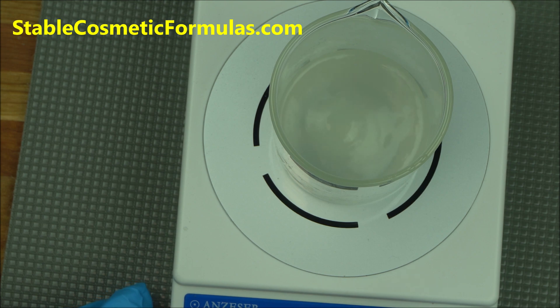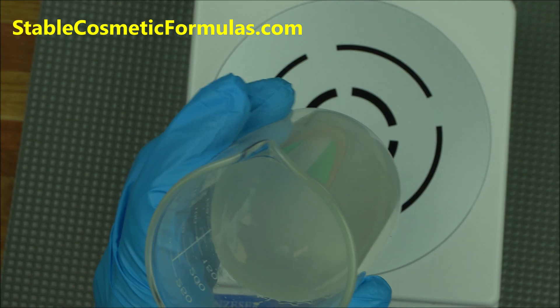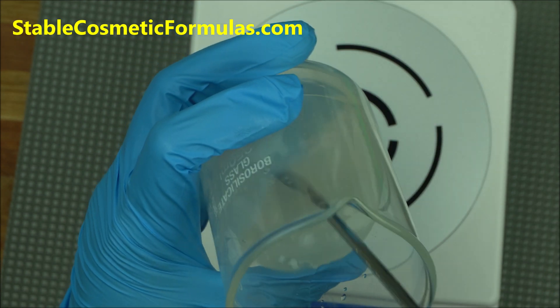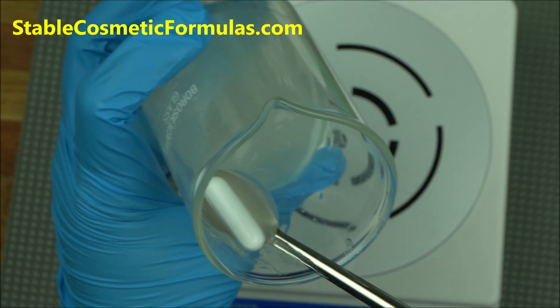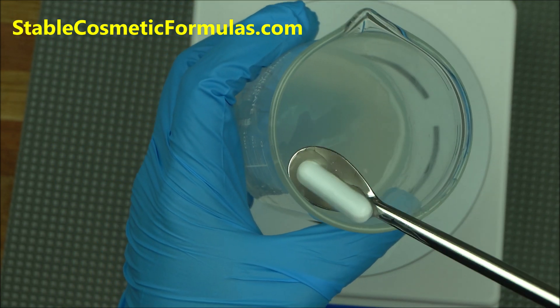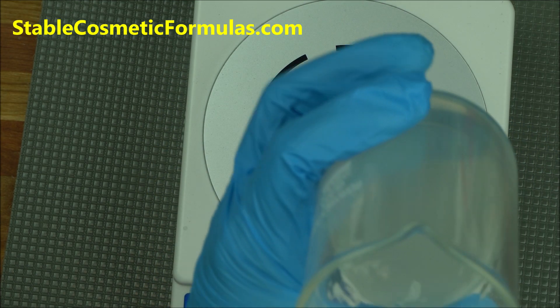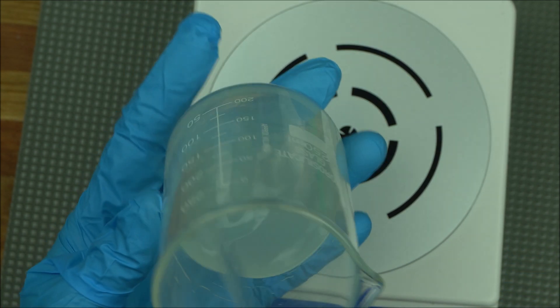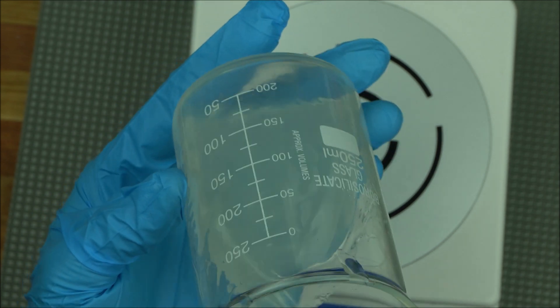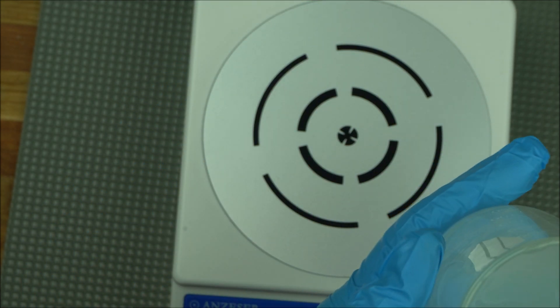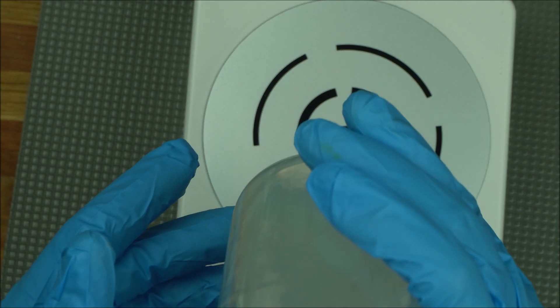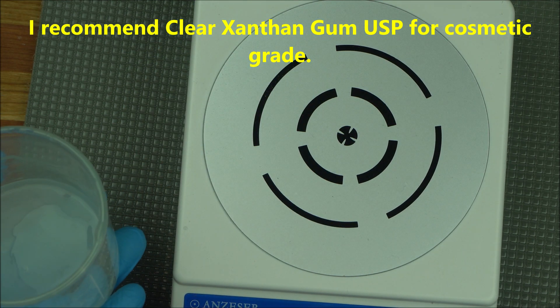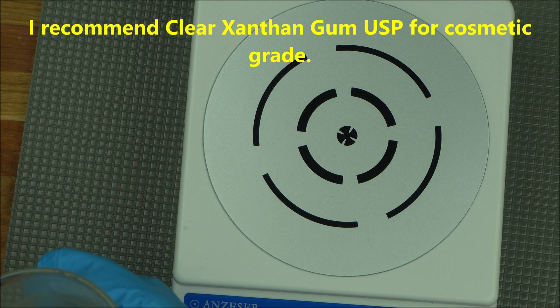The next thing you want to do is just remove your stir bar. Do not use your hand to remove it. Make sure you use something else to retrieve the stir bar. As you can see, this is amazing. This gel is so smooth and all together. It's the ideal gel to use to make your products, whether you're making a facial gel or anything. There's no hair in it because we use vortex technology.